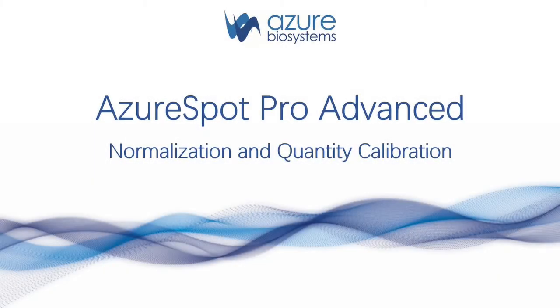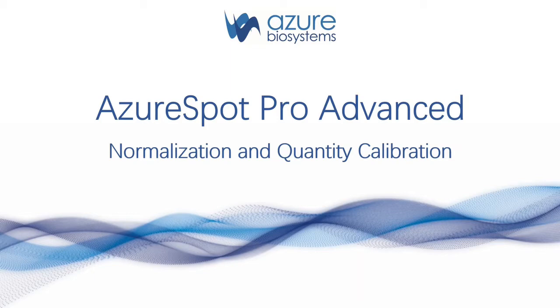Hi, this is Azure Biosystems and today we're going to go over normalization and quantity calibration using Azure Spot Pro analysis software.